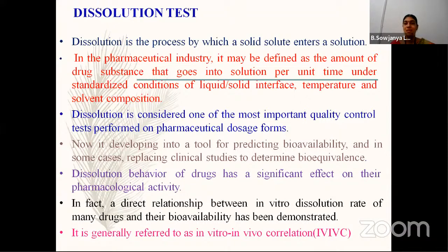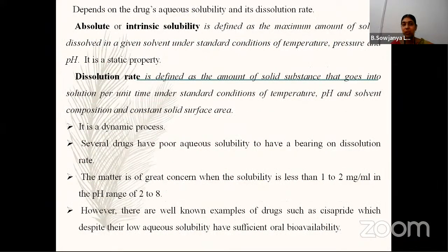The dissolution behavior of a drug has a significant effect on its pharmacological activity, simply the therapeutic activity. There is a direct relationship between the in vitro dissolution rate and the bioavailability of the drug, which is simply called in vitro in vivo correlation.